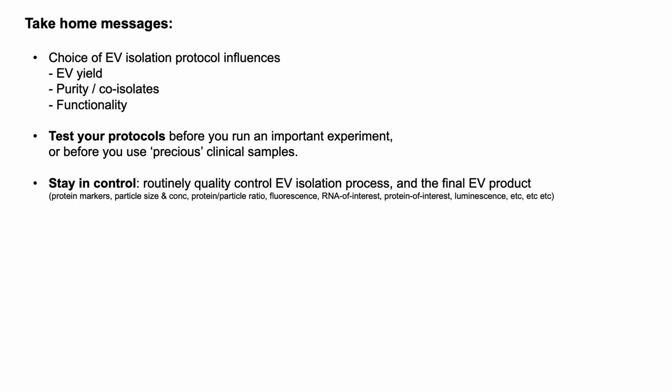So now for the take-home messages, I think I've shown you that the choice of EV isolation protocol influences the EV yields, the amount of co-isolates, and the functionality. I think it's very important to test your protocols before you run an important experiment with precious clinical samples.